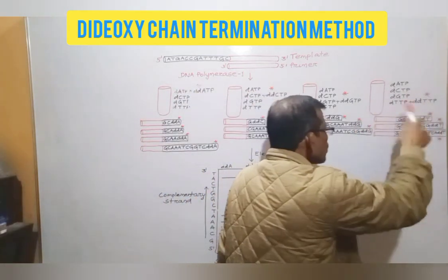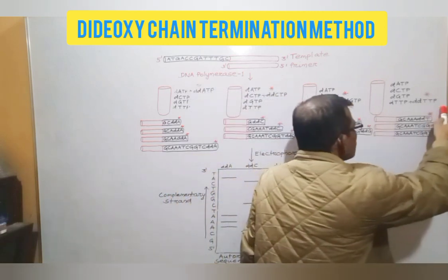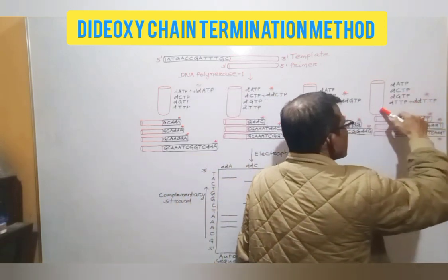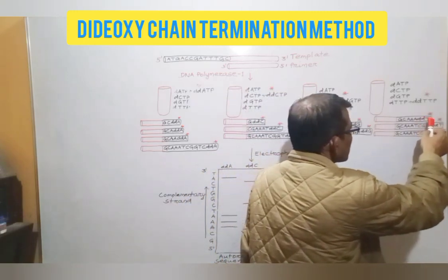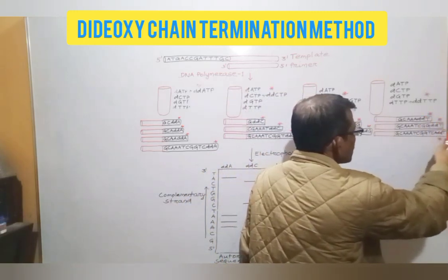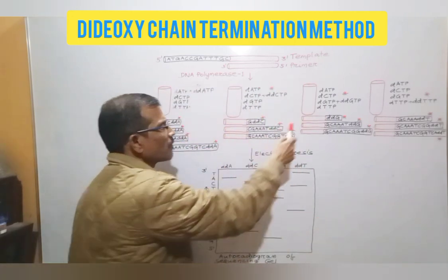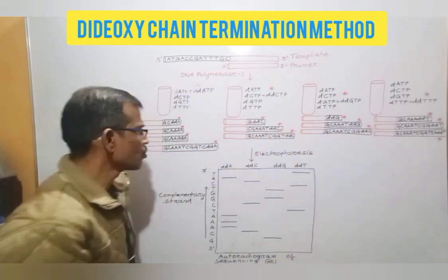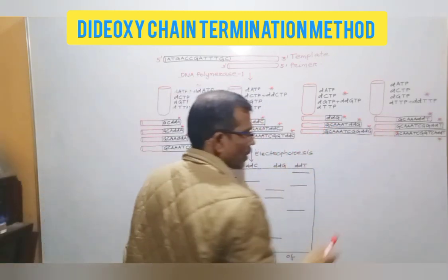But in batch 4 chemical reaction, due to the inclusion of dideoxythymidine triphosphate in the reaction mixture, replication will be terminated at dideoxythymidine triphosphate. So, from these 4 different types of chemical reactions, we will get 4 different sets of labeled DNA fragments.